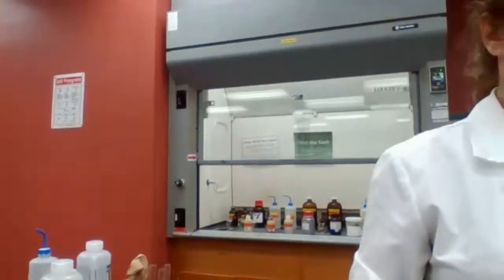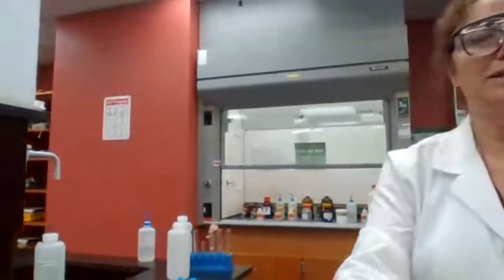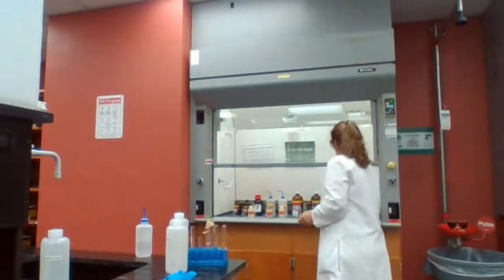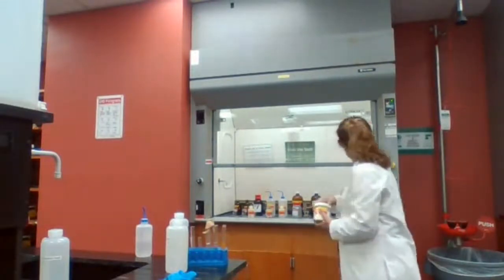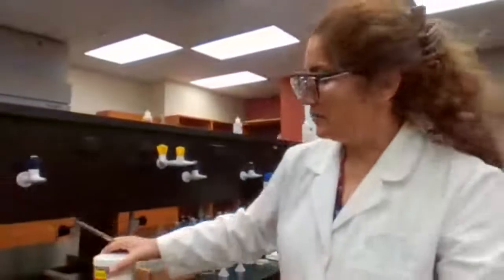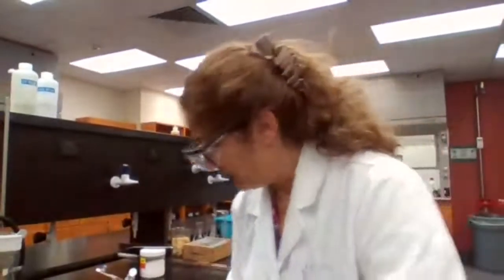Next part for the experiments with the benzoic acid is titration, right? How do we do titration? Help me with the titration procedure. What should I do first?